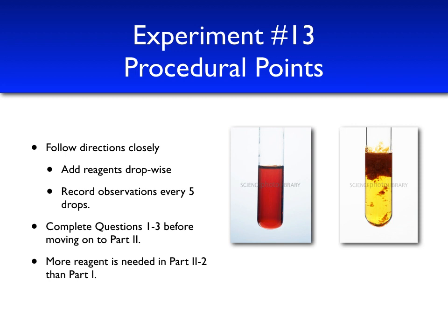As you're doing this experiment, it is important to pause after recording observations for the 20 reactions and complete questions 1 through 3. These questions allow a bridge between part 1 and part 2 and allow you to narrow down specific tests that can be performed in order to identify metal cations in the unknown solution.